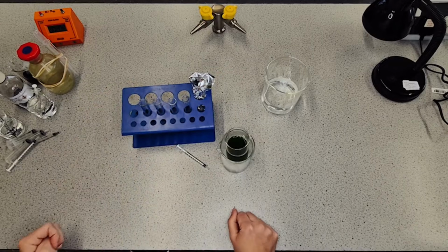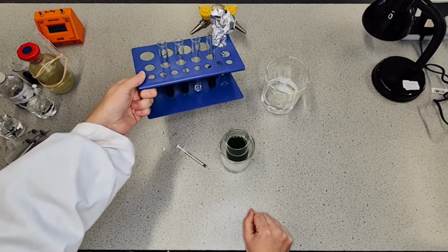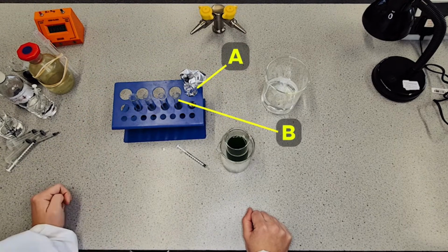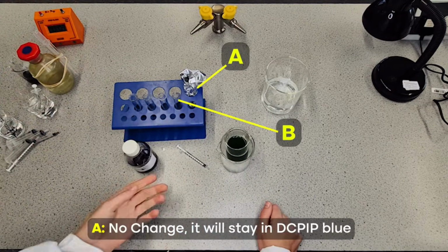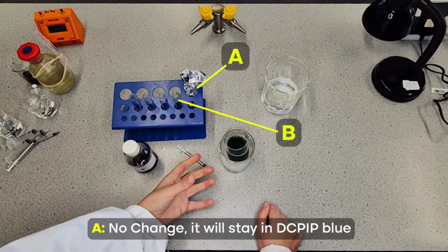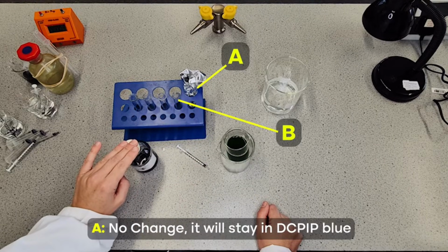So just to go through at this stage then, before I add in the chloroplasts, what we have going on in each test tube. We said A and B are both control experiments. A, we are expecting there will be no change. It will stay this DCPIP blue colour because if there's no light energy for the chlorophyll to absorb, and therefore no photoionisation of chlorophyll, no electrons released, DCPIP can't pick up electrons. So the reaction won't happen.